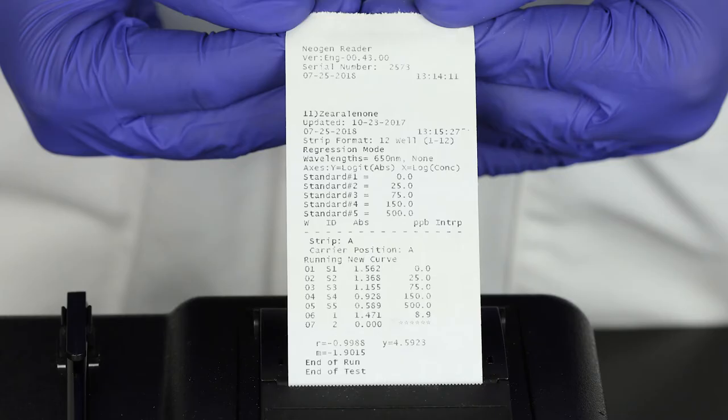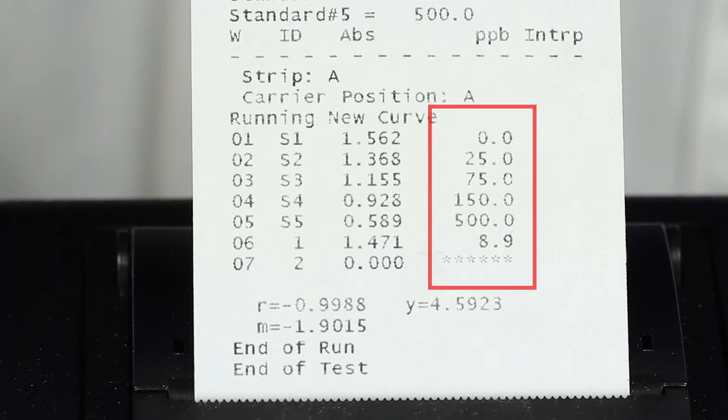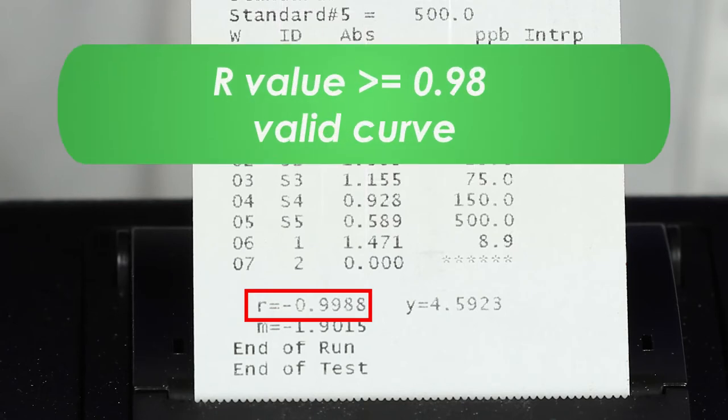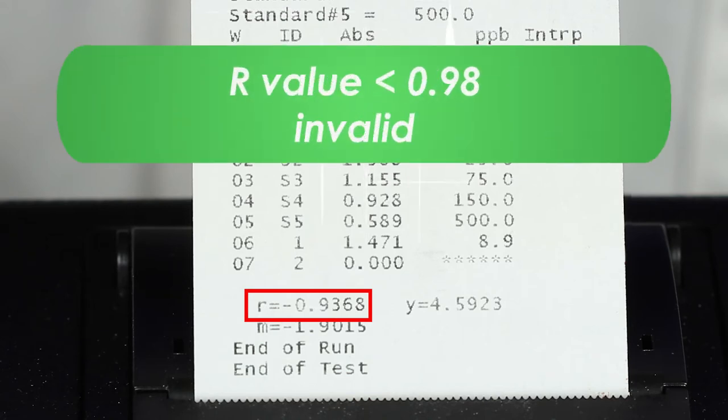The reader will print out the receipt with quantitative values for controls and samples. The middle column is the absorbance of each well. The right hand column shows the exact parts per billion of the controls and sample. Below the columns is the R value. This value must be 0.98 or higher to be a valid curve. If the value is less than 0.98, the curve is invalid and the test must be run again.